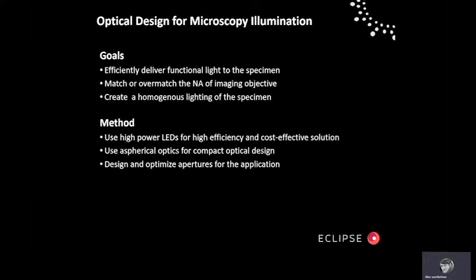So the goals of this design is to efficiently deliver functional light to the specimen. This is the most important. Then you usually want to match or overmatch the NA of the imaging objective, and at the same time create a homogeneous lighting of the specimen. So you need to know a lot about microscopy to do this design.